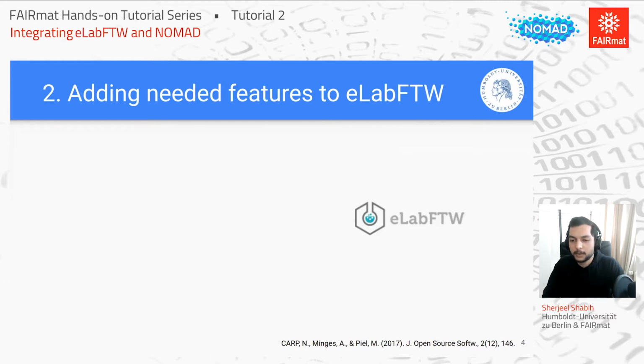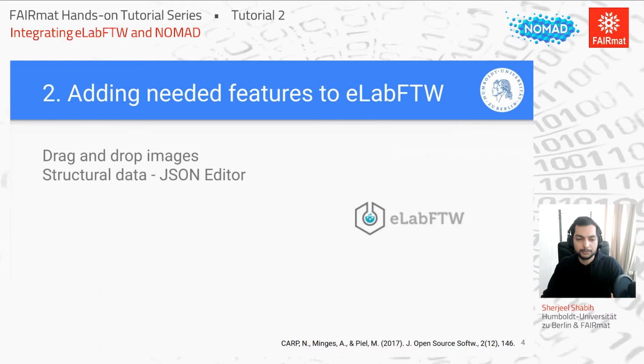So initially, when we started using eLabFTW, there were some features like the rich text editor and whatnot, but a lot of things that we really expected to have or were already in our workflow didn't really exist. So our lab tried to implement these ourselves because eLabFTW is free and open source, so it's easy to do that. So the initial things we added were the drag and drop images option you see. Initially eLabFTW didn't have this, and we're really used to taking screenshots of things that we've acquired, like data in our acquisition software, and pasting it into OneNote. So it really recreated that kind of workflow.